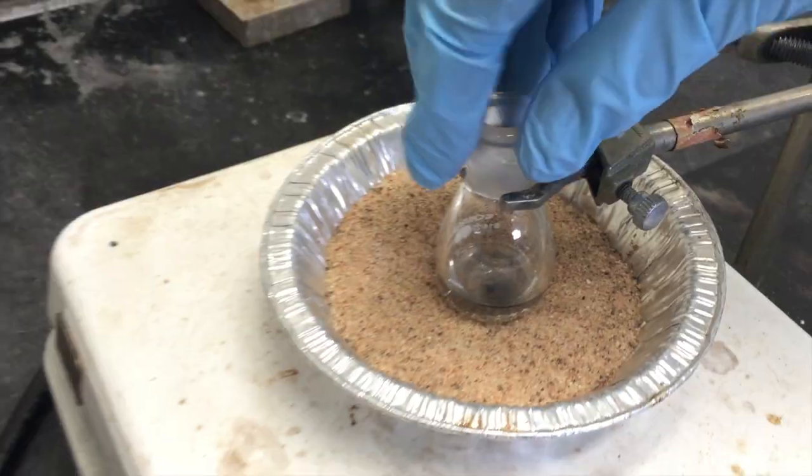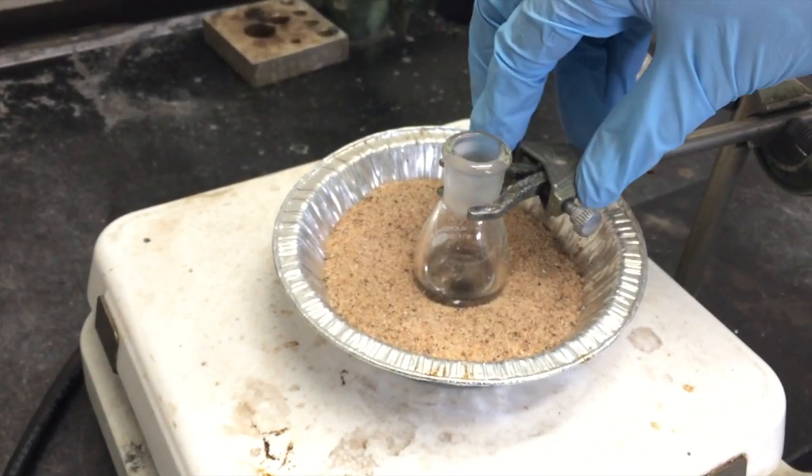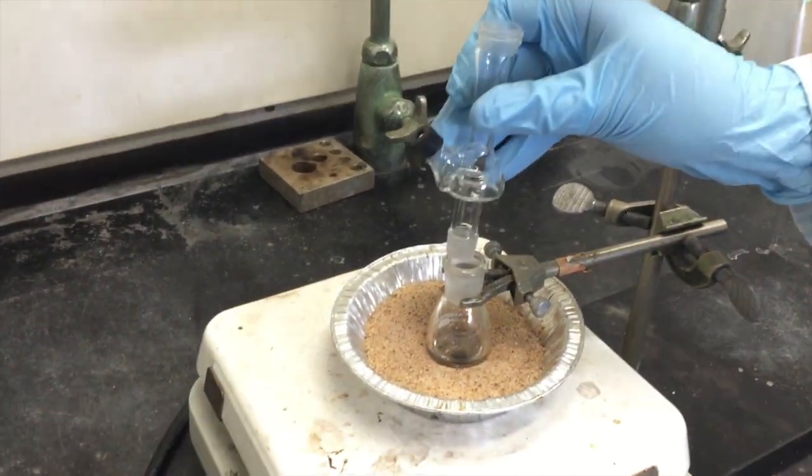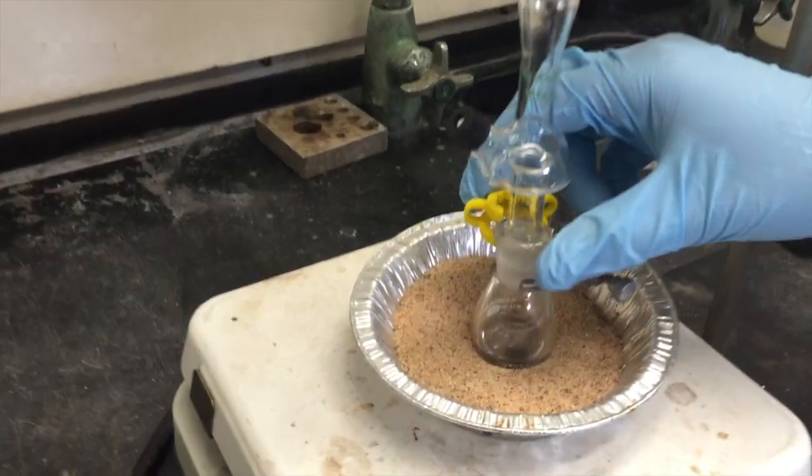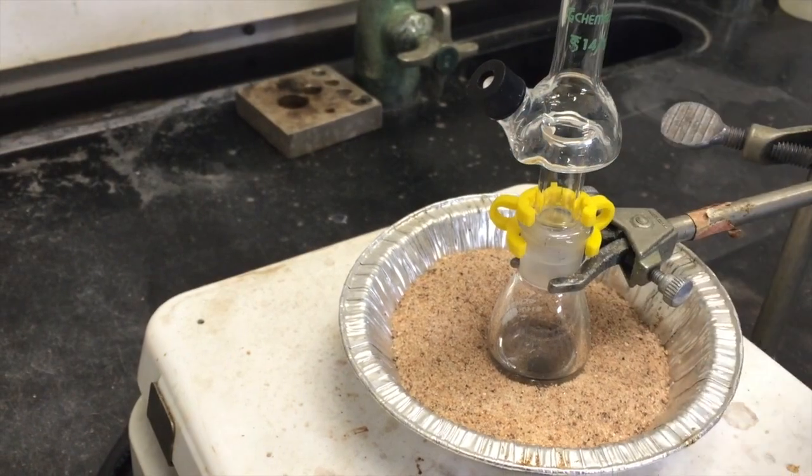Jiggle the flask into the sand for more efficient heating. Insert the Hickman still into the round bottom flask and clamp it in place. The Hickman still will act as the condenser.